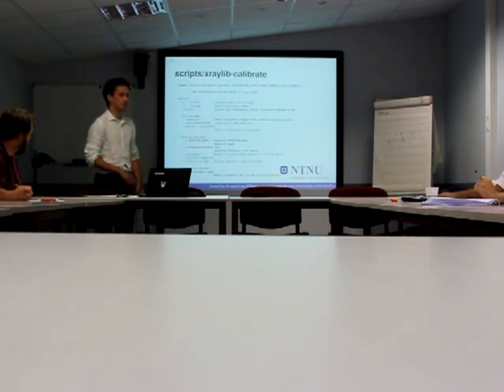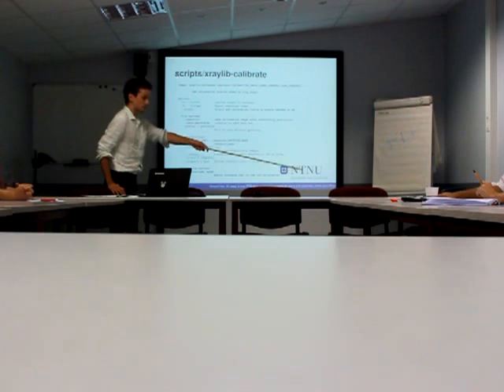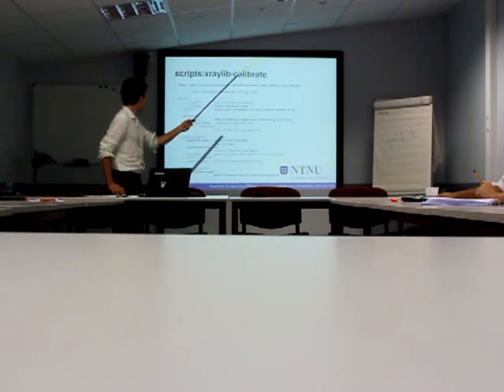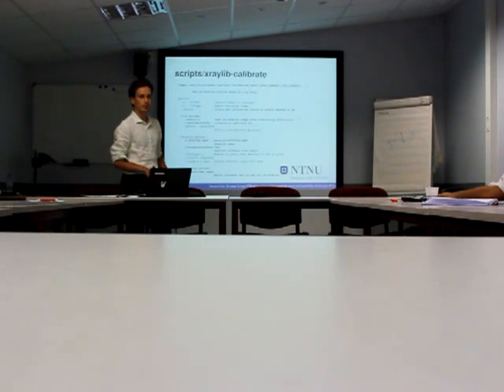So this is how you would invoke it from the command line as it is. So there are quite a few options, and you don't really need all of them. Strictly speaking, you only need the detector name and the calibration image. And we'll try to find everything and write the resulting geometry to file that pyFAI can read and use for the integration.